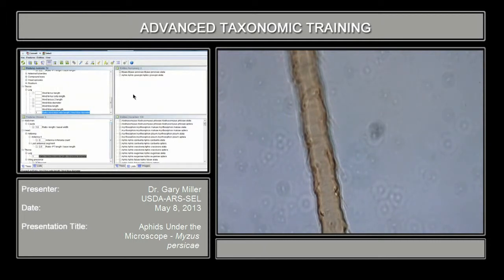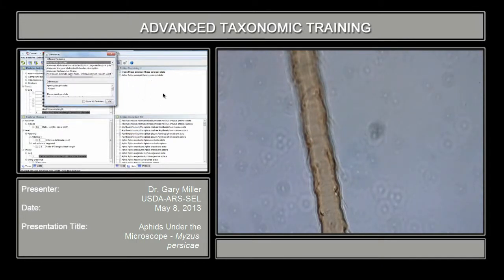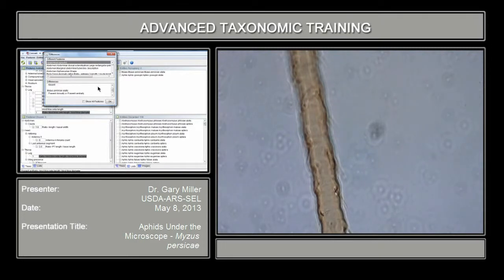So now we're down to two taxa left: Myzus persicae and Aphis gossypii. If you check the differences, it'll tell you the differences between Myzus persicae alates and Aphis gossypii alates. What it's saying is that head spicules for Aphis gossypii are absent, but in Myzus persicae they're going to be present dorsally or present ventrally. So that's the main character to determine those two species.